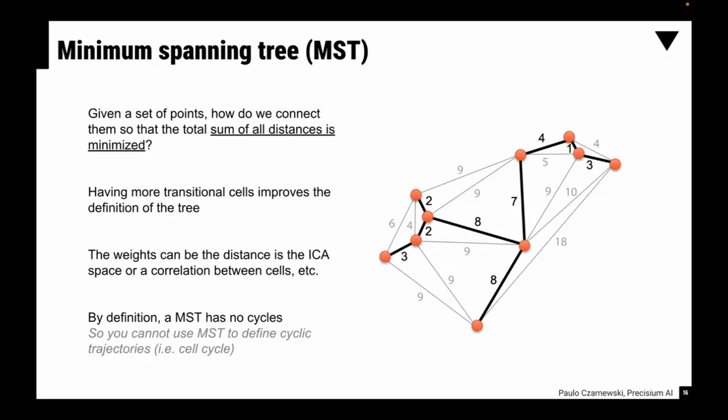The reason is because if you do not do that, then just like when you do clustering on your data set, you want to find clusters that are common across all your data sets. So let's say that all T cells fall into the same cluster. Here it's exactly the same. So we want the differences to be because of the cell differentiation process rather than by batch effect. Otherwise, you'll see, for example, the trajectory will start in one sample and then finish in another, even though those samples actually have the same time point.